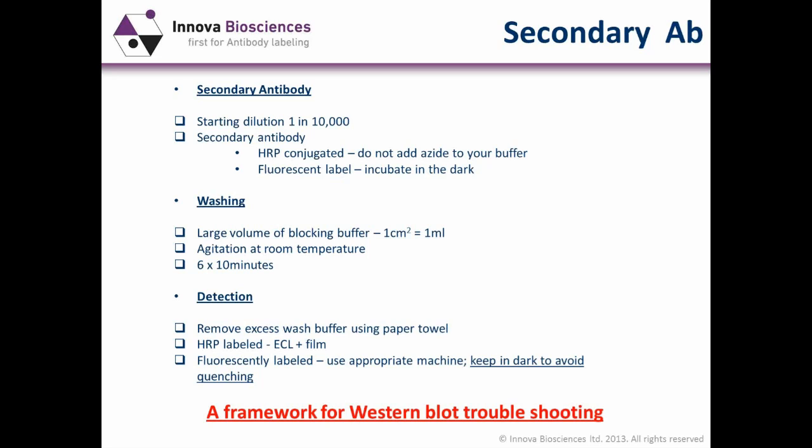Going back to the wash steps, it's the same advice that I suggested in regards to the primary antibody. Again, don't be tight in regards to your block and buffer. It costs peanuts to put it together. Your time's more precious. Invest your time wisely in trying to get your blot right this time, so spend more time on your wash steps.